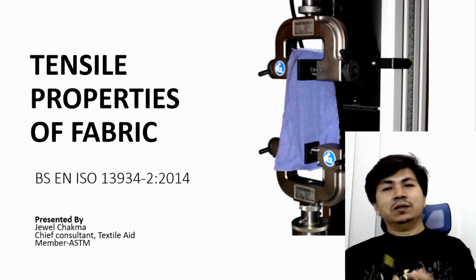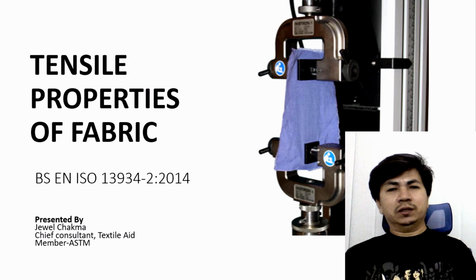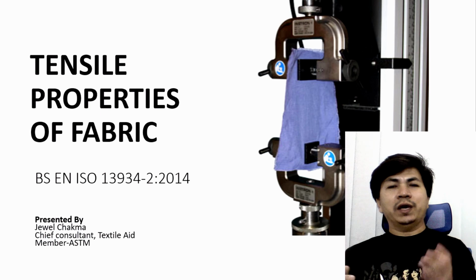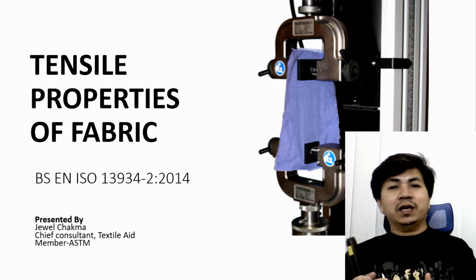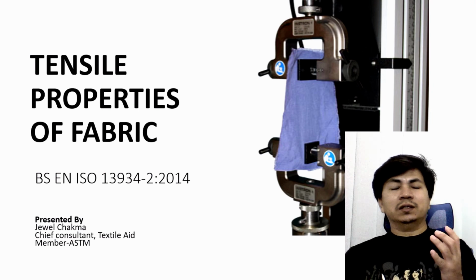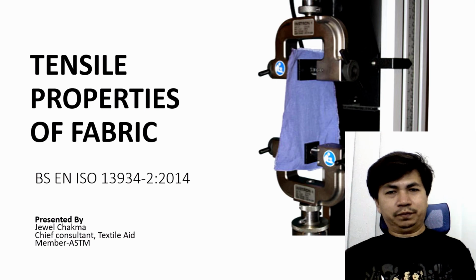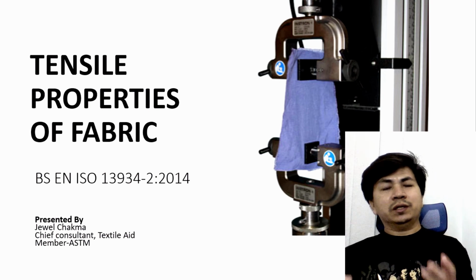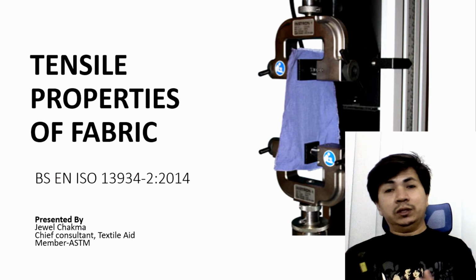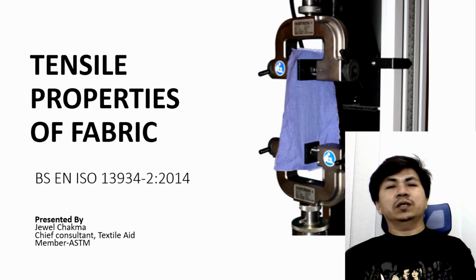And what is the strip method? In the strip method, we grip the whole width of the specimen and apply tension to find out the breaking force of that material. That is called the strip method. So today we are discussing the grab method, the international method BS EN ISO 13934 part 2.